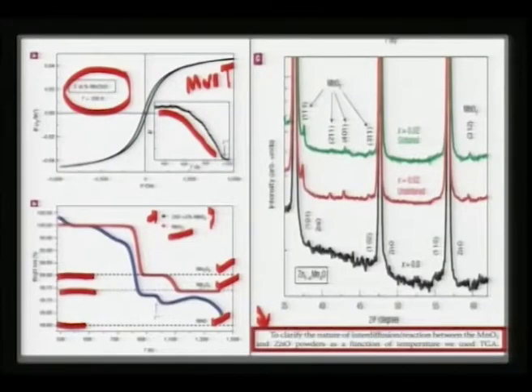Another thing, that the Mn2O3, Mn3O4 are still present in 2% MnO2 doped zinc oxide. Therefore, there is a clue that probably manganese is not exactly getting doped even at 700-900 K, it is still remaining as a phase of Mn3O4 or Mn2O3.